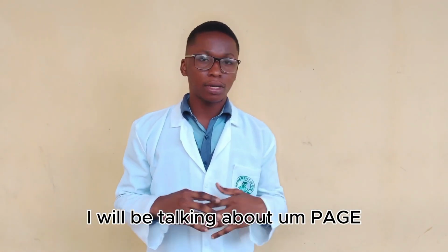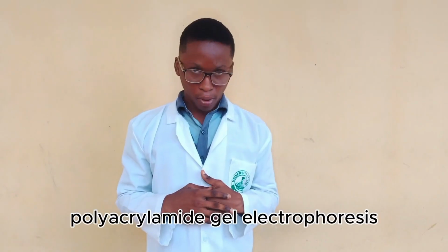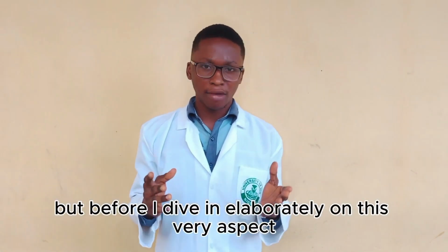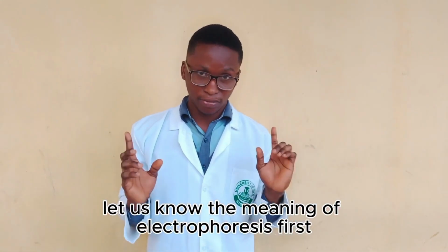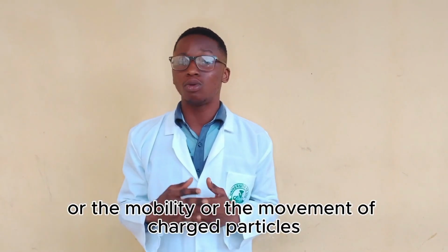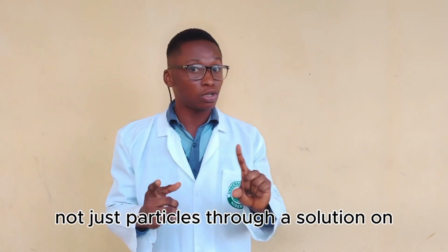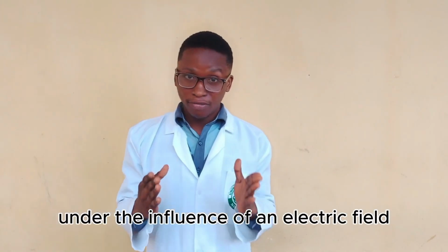I will be talking about PAGE, the acronym standing for Polyacrylamide Gel Electrophoresis. But before I dive in elaborately on this aspect, I would like us to know the meaning of electrophoresis first. Electrophoresis is simply the migration, mobility, or movement of charged particles through a solution under the influence of an electric field.